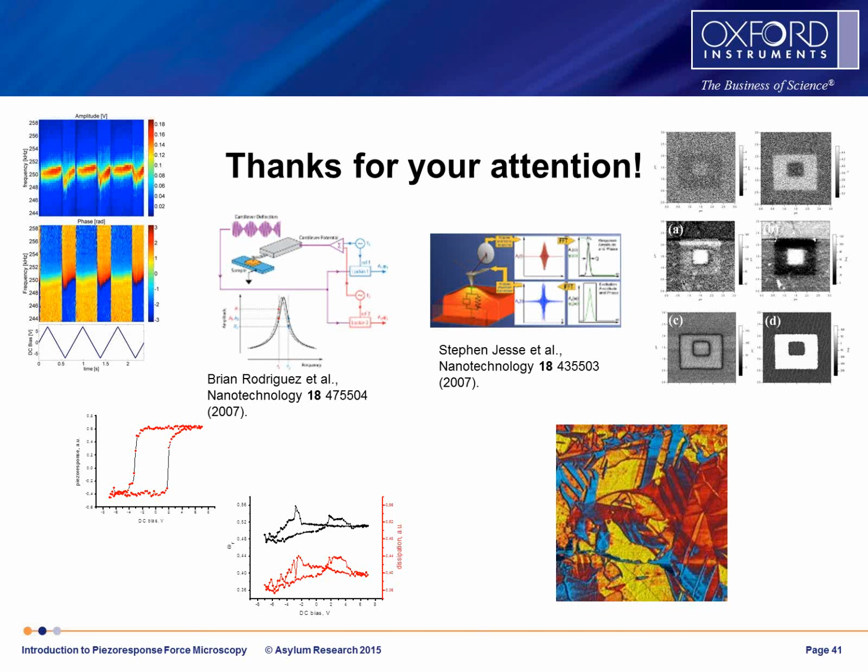Thanks, Sergey. One more question for you. Can you comment on background noise in PFM measurements, and especially how to identify it and how to avoid it?